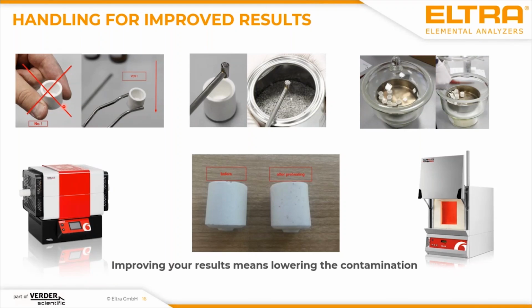This is one reason why you should always obey the rule, never touch a crucible. Of course, the other reason not to touch a crucible, especially if you work with low concentrations in the ppm range for carbon, is because the grease or fat on your fingers will diffuse inside the crucible, and you will measure them additionally to the carbon content in your sample. Rule number 1, perhaps the most important rule.